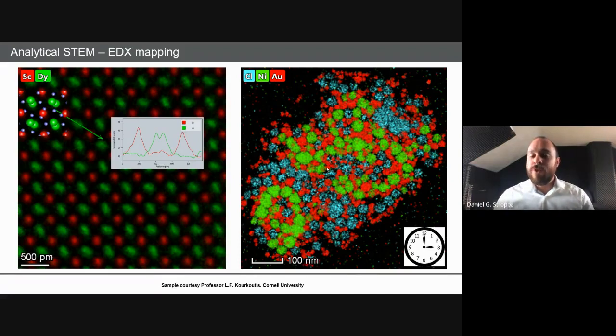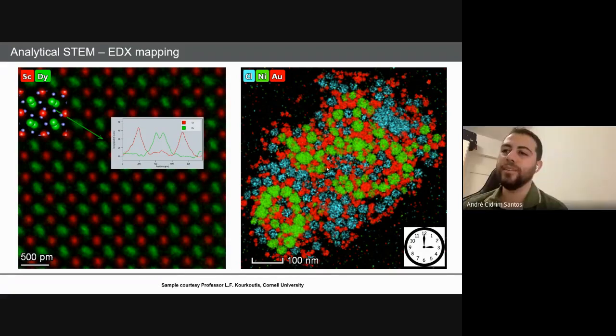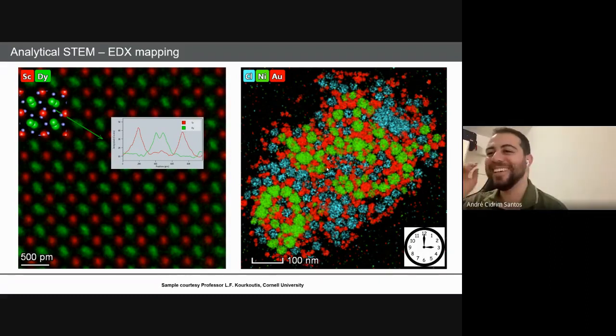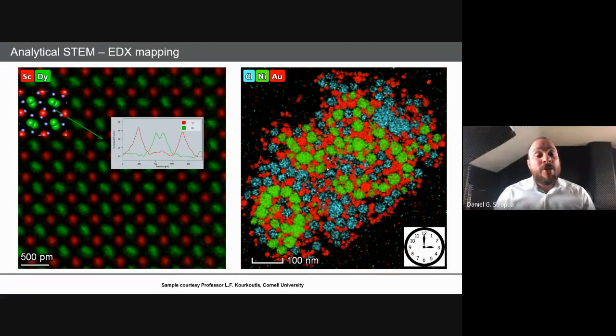Chemical reactions, there is another way that you can do, but it's something that I did not have in mind to discuss, is that you can use laser excitation of the tip and laser excitation of the sample and do the illumination in stroboscopic mode. So then you can do time delay exciting the sample. So if you have a reversible process on your sample, you can study down to, I think, faster than nanosecond resolution, but in a stop motion way. Okay. But this is quite far from the traditional.